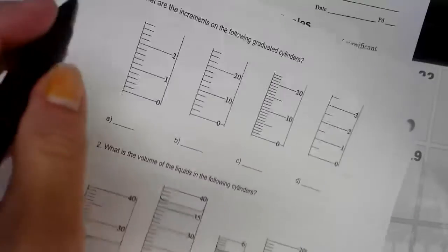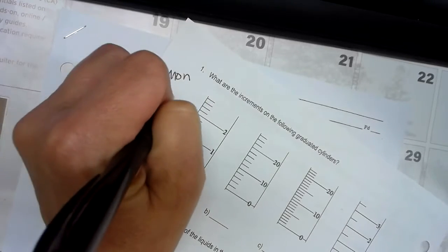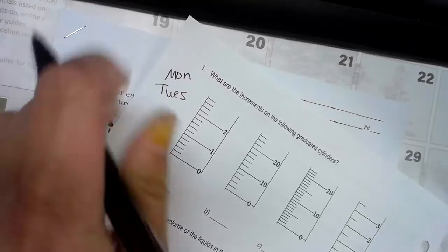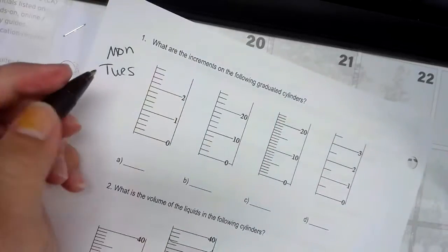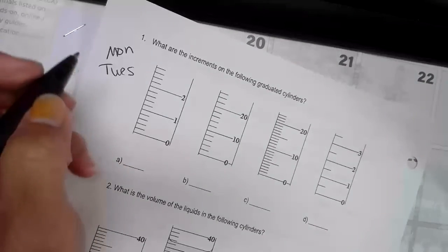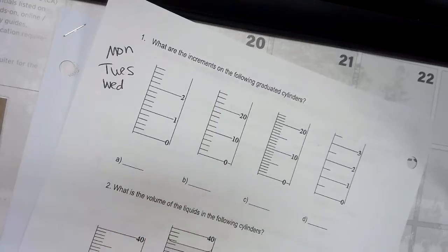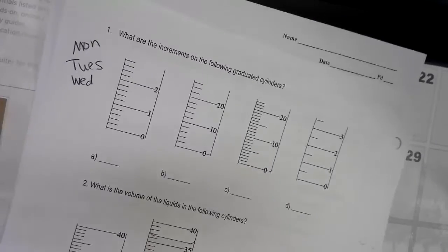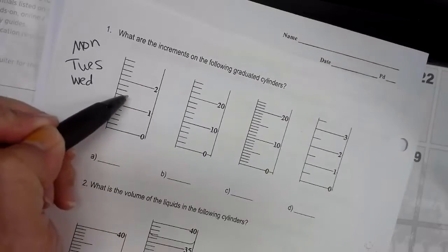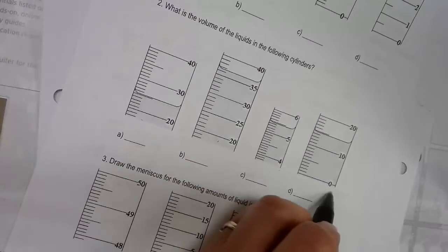This is what we covered a little bit on Monday, and we also covered it on Tuesday for some of the sections. If we didn't cover it, because I was out part of Tuesday, then for periods 4 and 2, we're also going to cover it on Wednesday. These are more like practice ones, to go over how to read increments. How can you determine what each of these lines represents? Then you're trying to figure out what these volumes would be recorded to.